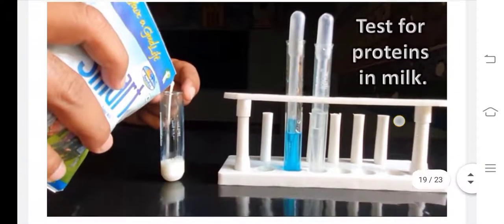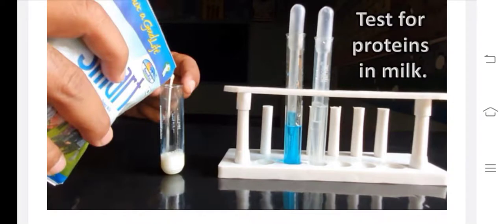Now we can move on to one example, test for proteins in milk. Observe here. Clear?